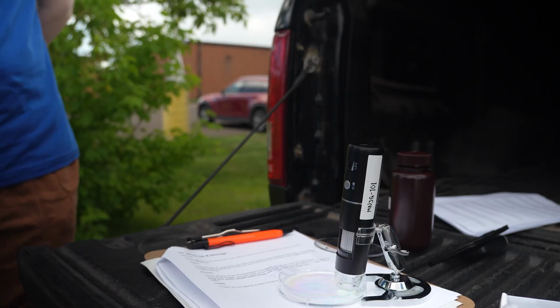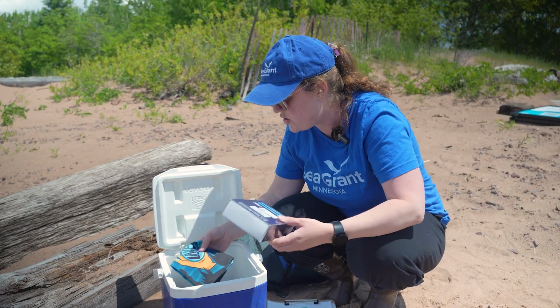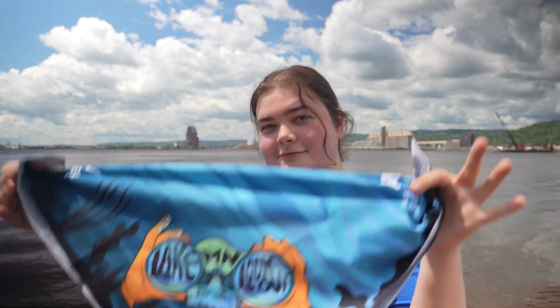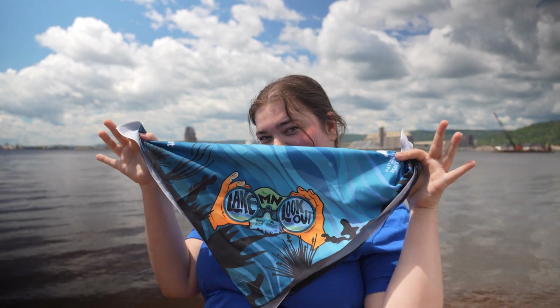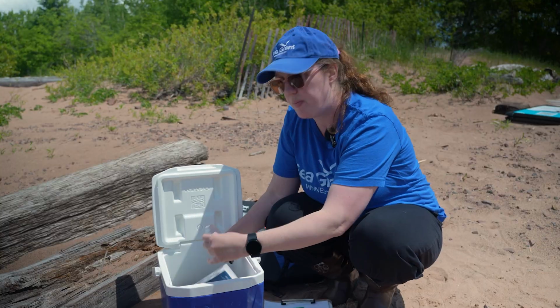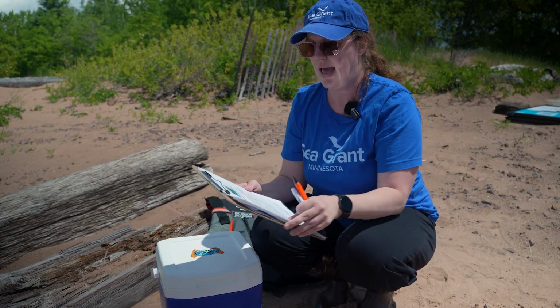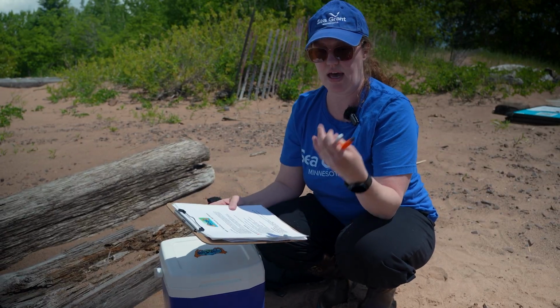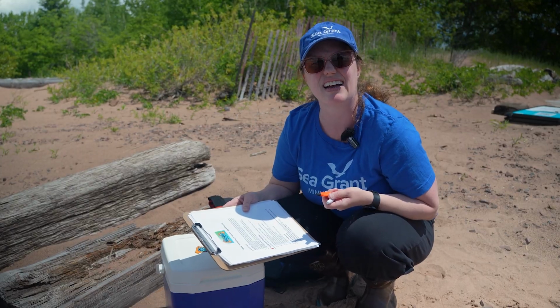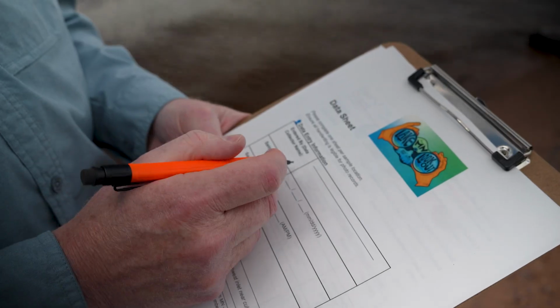And then other items in your kit will be this digital pocket microscope. We're gonna walk through exactly how to use this, but this is how you can take detailed pictures of your bloom. We also have these nifty project bandanas, which we will show in more detail later, but these are really nice if you're in the field, especially on a hot, sunny day. And then we also have a Petri dish, which you will use for your pocket scope to take a look at the sample, and then your data sheets.